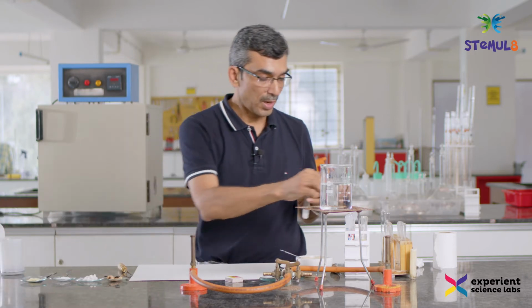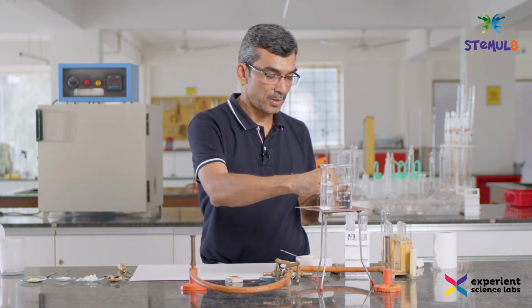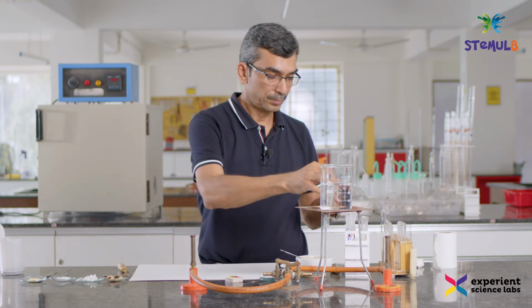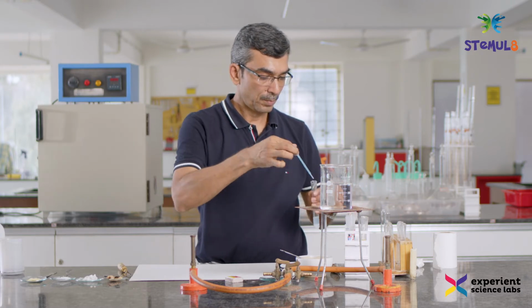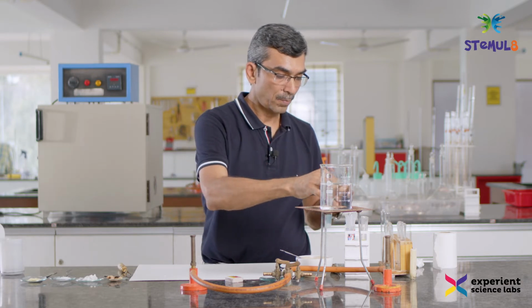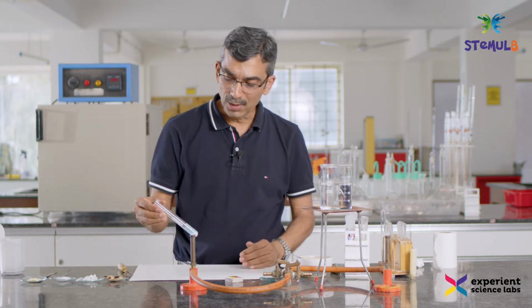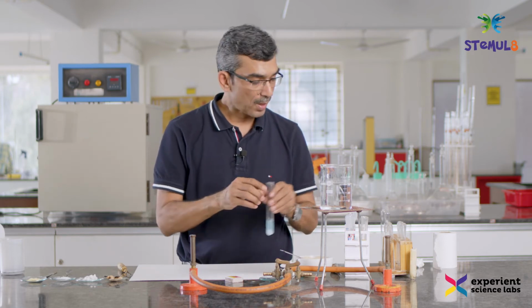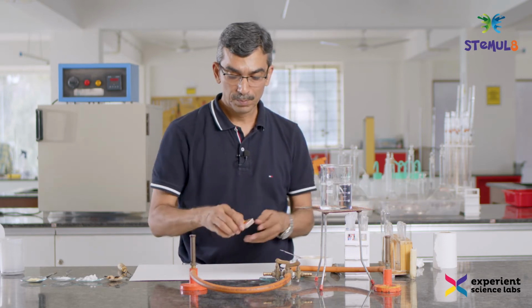And to this, I will add a few drops of biuret reagent. So when you add biuret reagent, the color is light blue, a nice looking light blue. And now I will heat this.